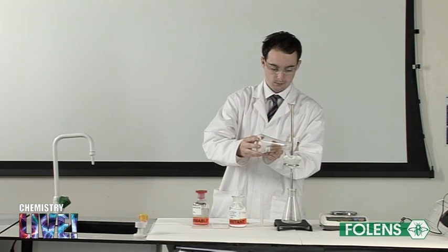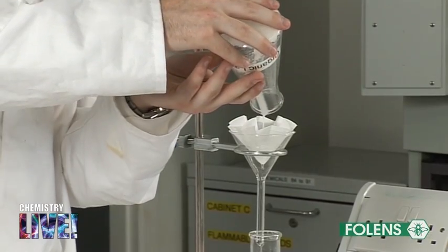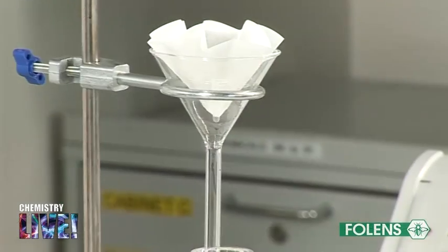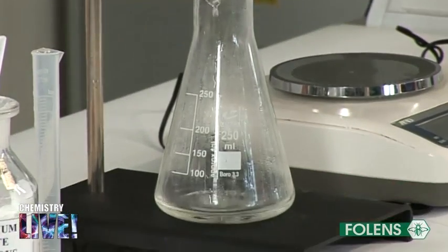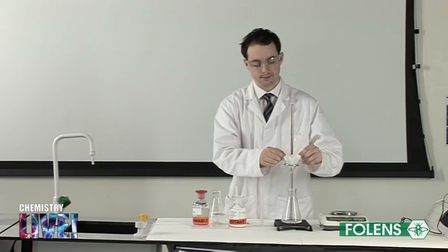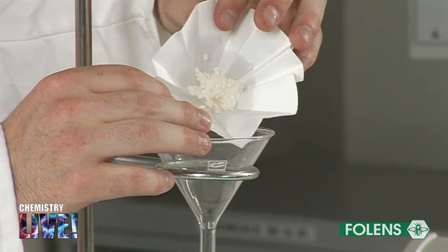The fluted filter paper helps to speed up the filtration as the surface area of the filter paper in contact with the liquid is greater than if the paper were folded in the more usual way. Note that the hydrated magnesium sulfate is retained in the filter paper.